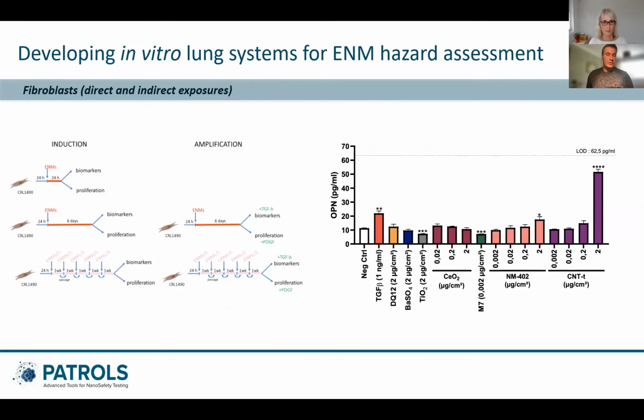So moving on from the short-term exposures to the relative long-term, we move on to the work from Sybil and Dominique at LTAP in Belgium. Predominantly they looked at fibroblasts, two different fibroblast cell types. And they looked at short-term and they looked at long-term. You can see their experimental approach here on the left-hand side.